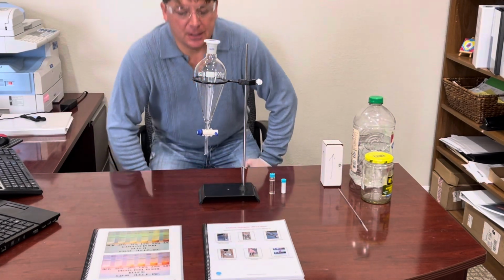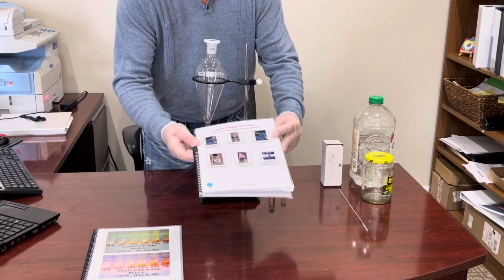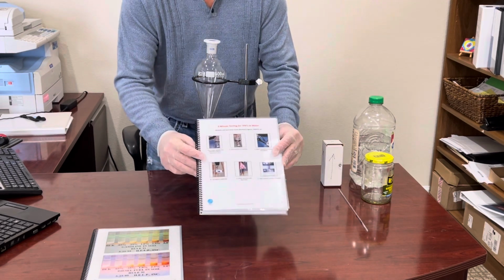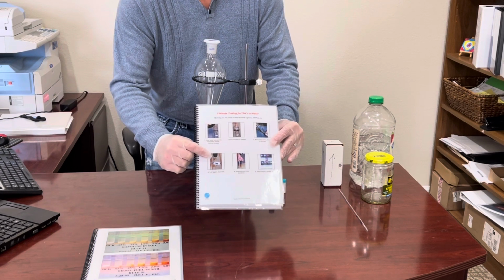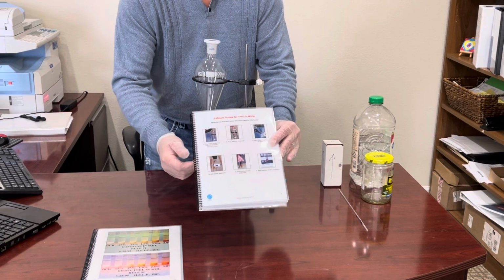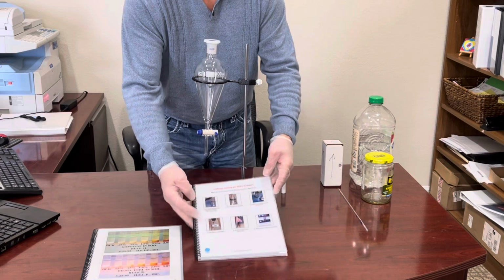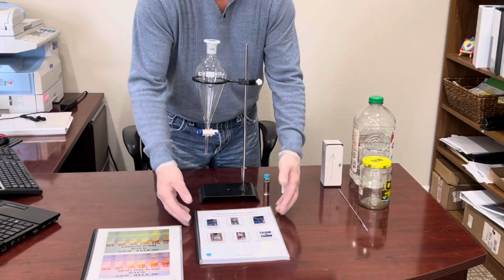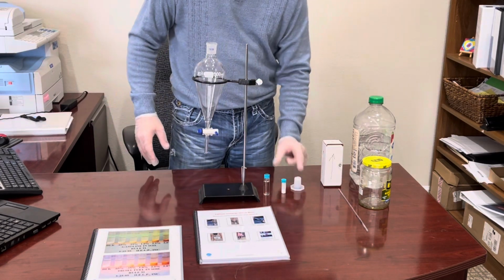What we're going to do is demonstrate our water kit with a slight change. Normally, we use an extract solvent that's heavier than water, so it sinks to the bottom, and we decant that off to run our analysis. But instead, today, we're going to use a lighter, different solvent that's going to float on water. So we're going to decant off our water sample prior to releasing our extract solvent to do our analysis. So with that said, let's get started.